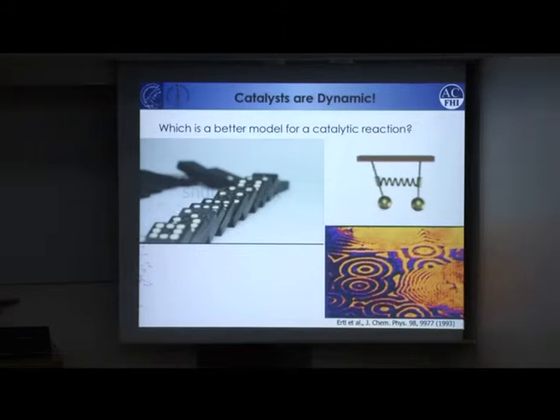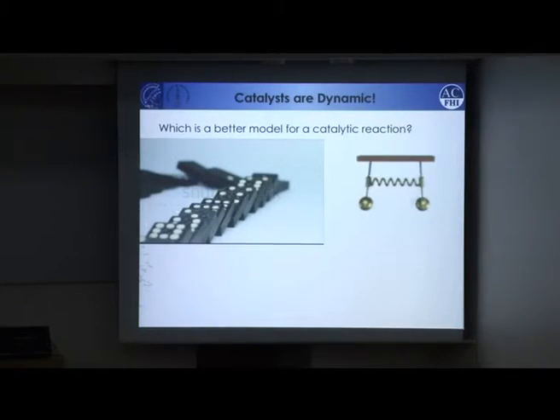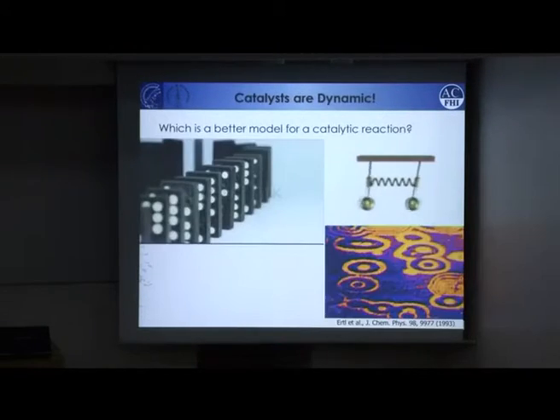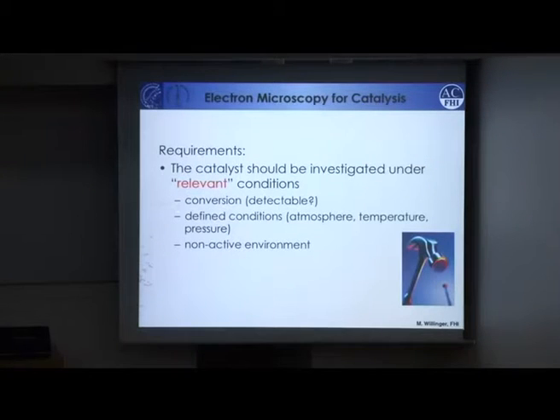You have your gas phase that is pulling in one direction, the catalyst is helping to do something else. And there are indeed some reactions where we could see this. Professor Ertl got a Nobel Prize for imaging these chemical oscillations. So what I have shown in the previous slide is not so relevant for catalysis because it just shows how a system adapts to a certain surrounding and then stays there. But we want to study dynamics. And that is the challenge.